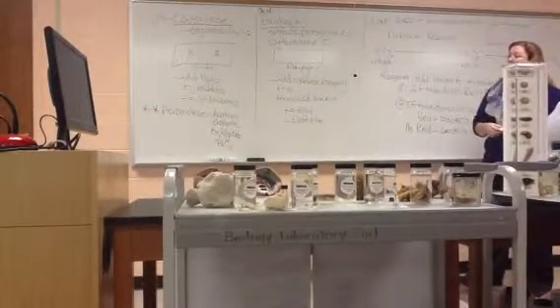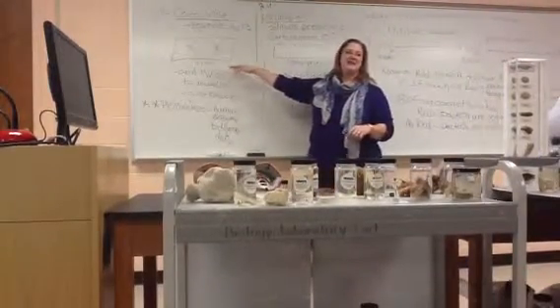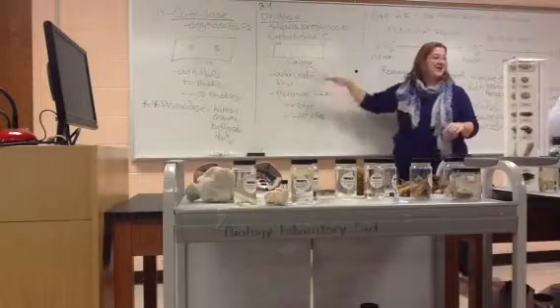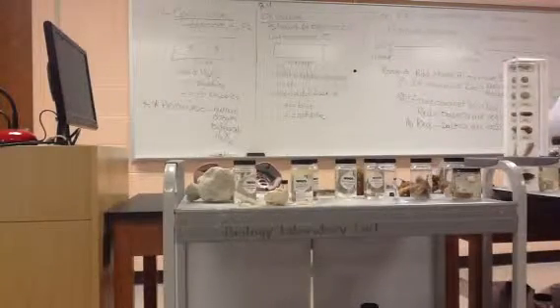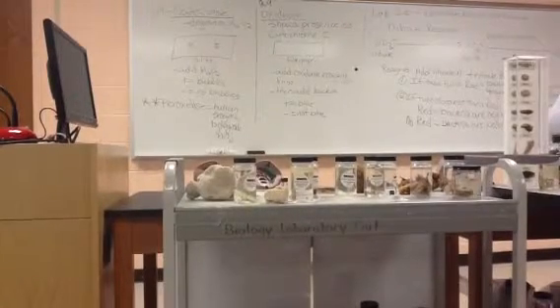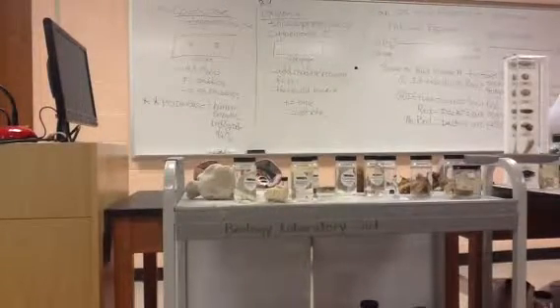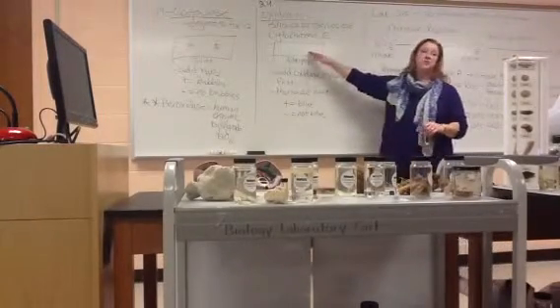All right, so this time you're doing it on filter paper, which I know looks just like my picture of the last slide, so I labeled it for you. Filter paper. It's in a box up here on the front table. It's a big roll. Just pull yourself off a piece about maybe 2 inches long. You can just tear it. It's fine. For this particular test, you have to add the reagent first to the filter paper.